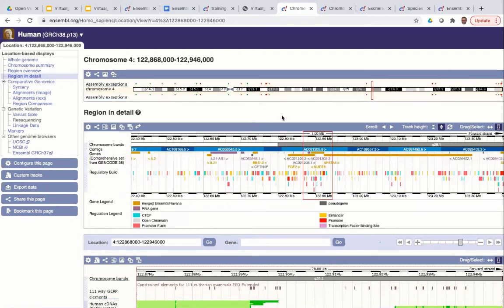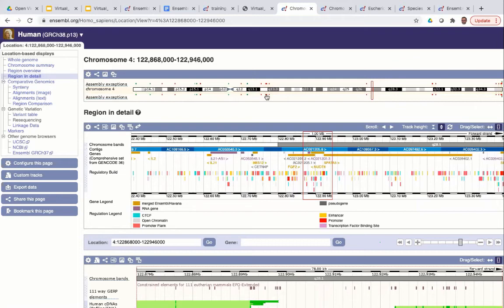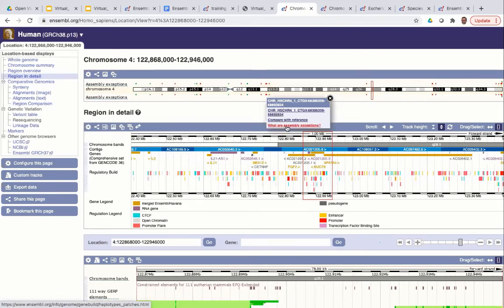Looking at the main part of the page, it's split into three separate views, each more detailed than the last. At the top is the chromosomal overview — you can see chromosome 4 with the centromere, the p-arm and q-arm, and our red box showing our region of interest. Outside the red box you can see green and red highlighted regions — these are assembly exceptions, which might be patches where there's been a small fix to the genome sequence, or haplotypic regions. You can click on them for more information, but for our current region of interest there are no assembly exceptions to worry about.